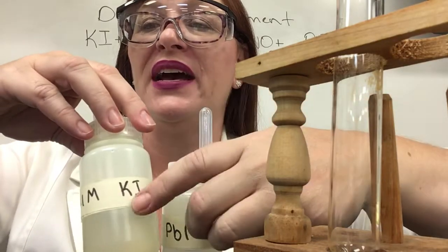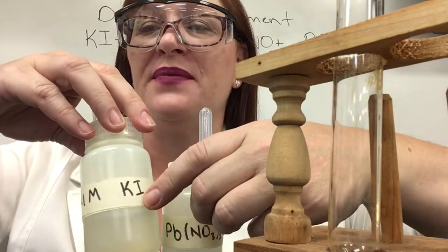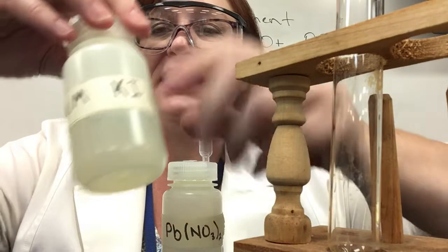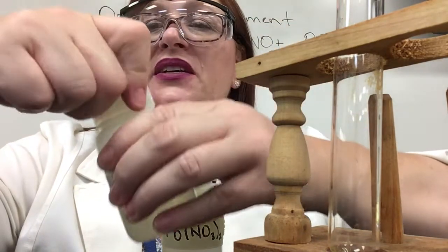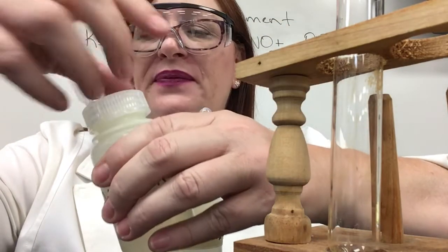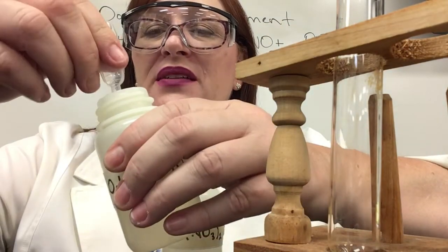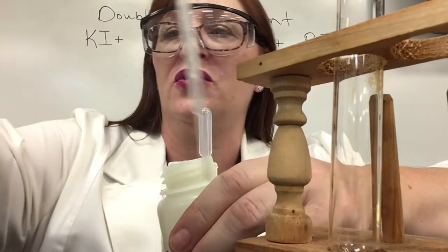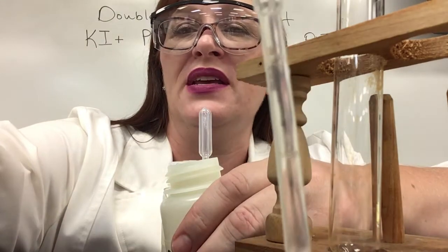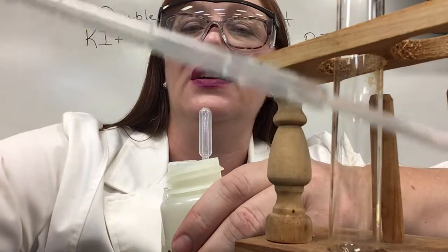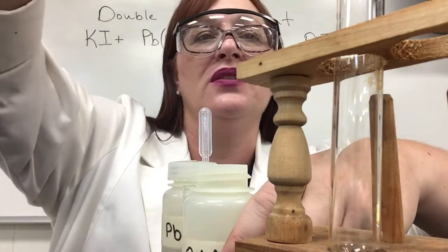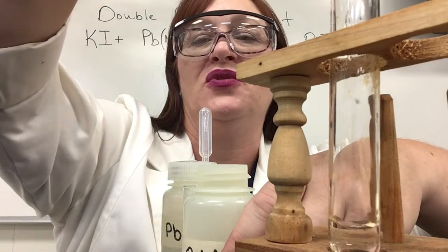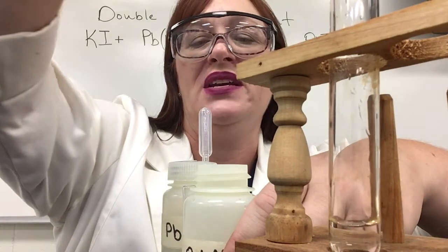This is KI — that's potassium iodide — and it is a clear liquid. Let me get some in my test tube and I'll show you what that looks like. Perfectly clear liquid, and I'm gonna squirt one squirt of that into my test tube there.